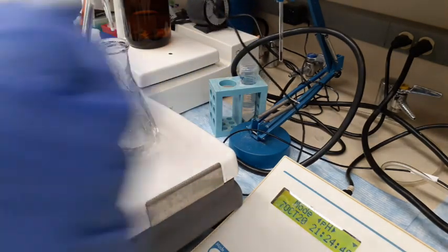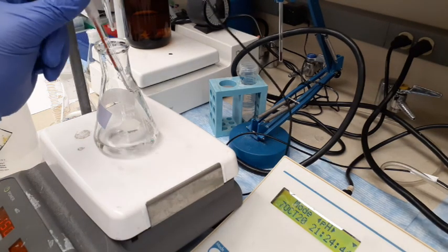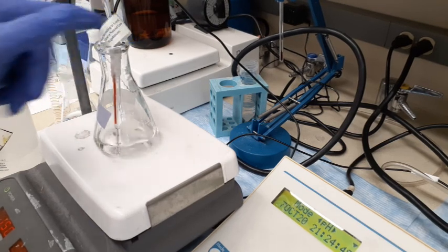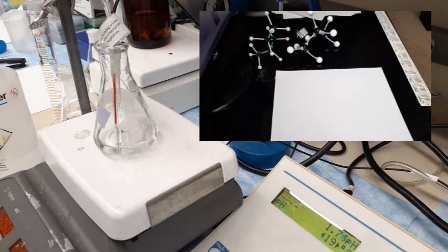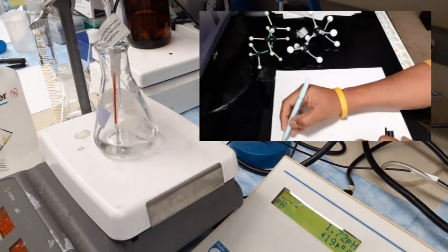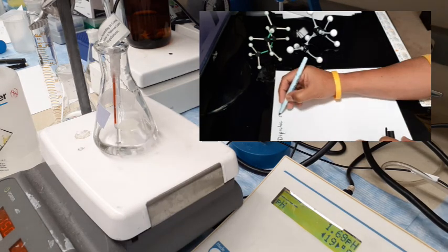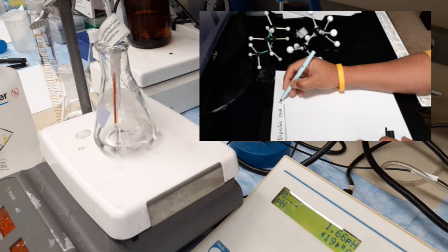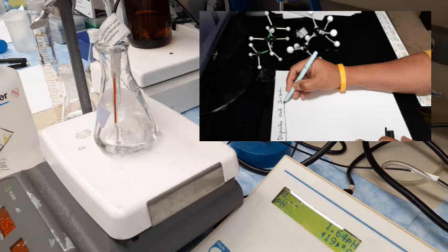Forward, this is a pH electrode, and it will just measure the initial acidic pH. Obviously that's very acidic. Right now it's showing about 1.71. So I'll wait until it stabilizes. So that's the initial acidic solution for our titration.